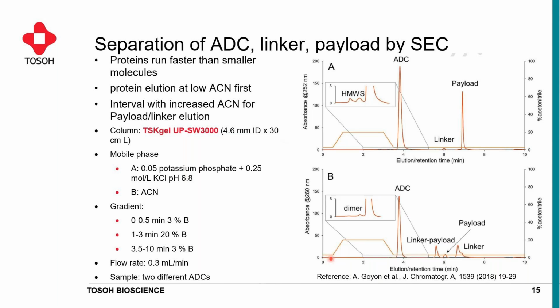Because again, thinking back how size exclusion works, we don't have interaction. We should not have any interaction between our molecule and the stationary phase. And we just have diffusion in and out of the pores.